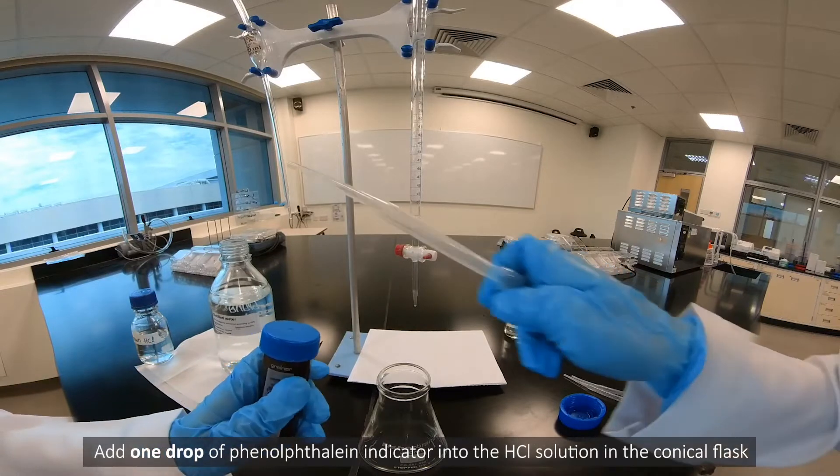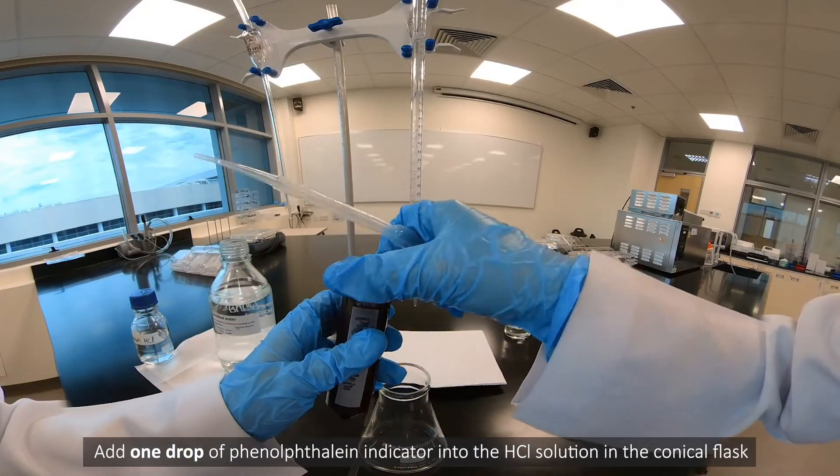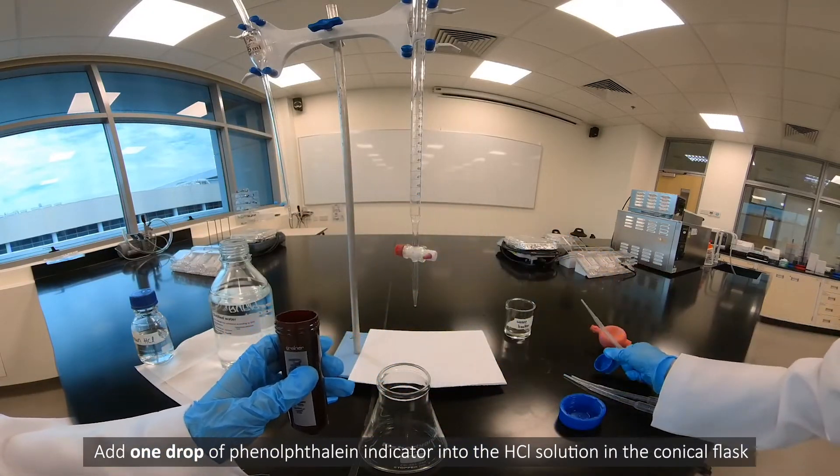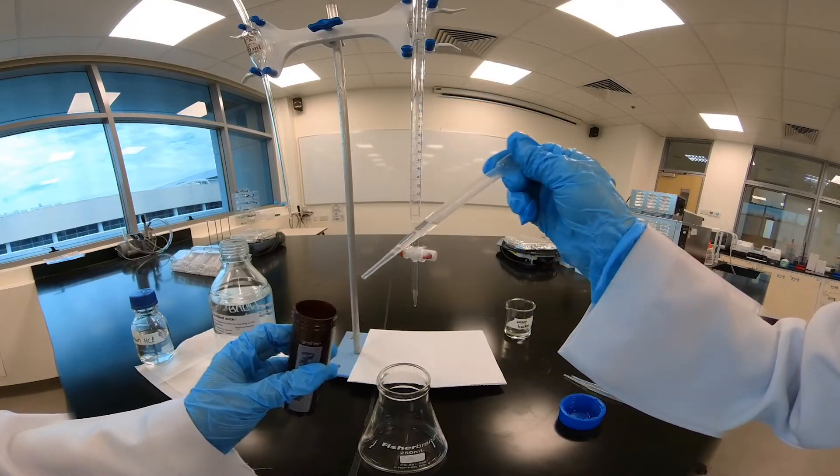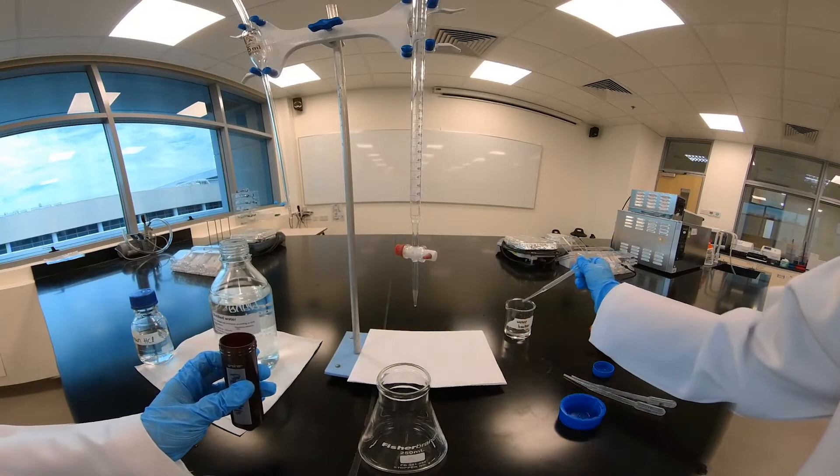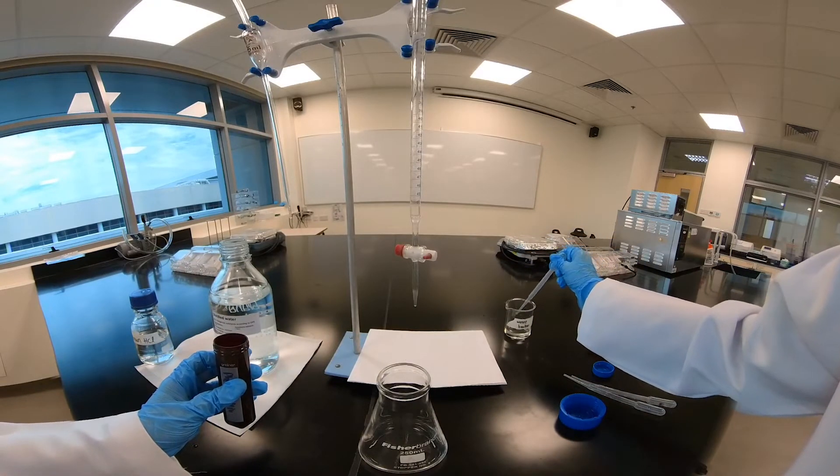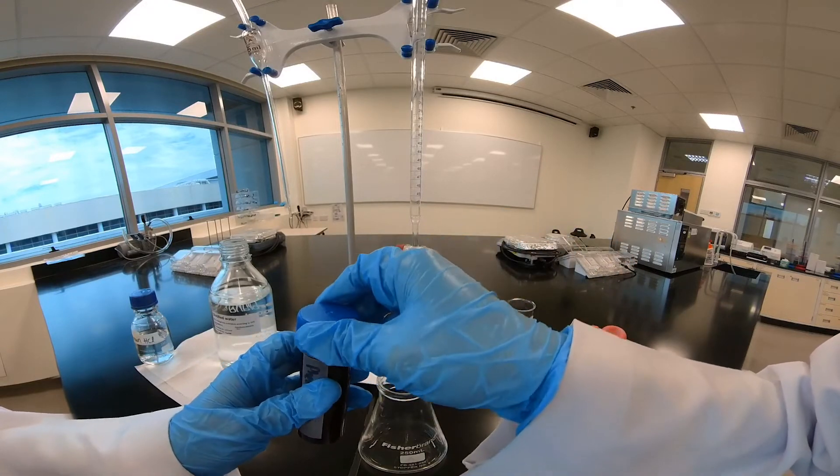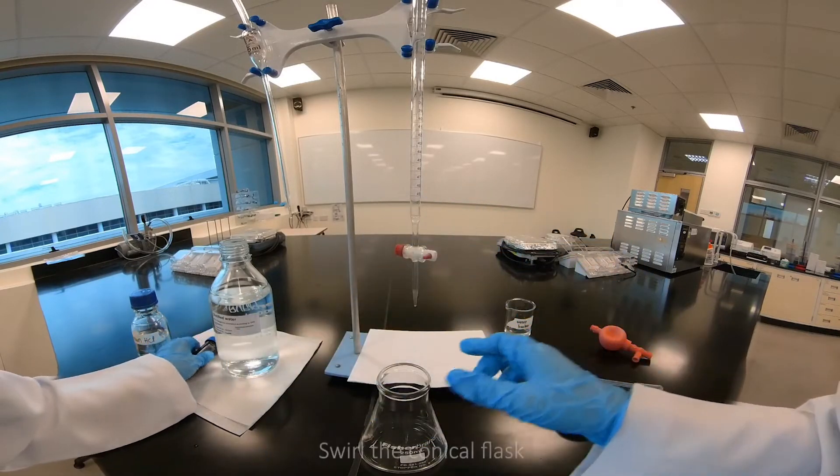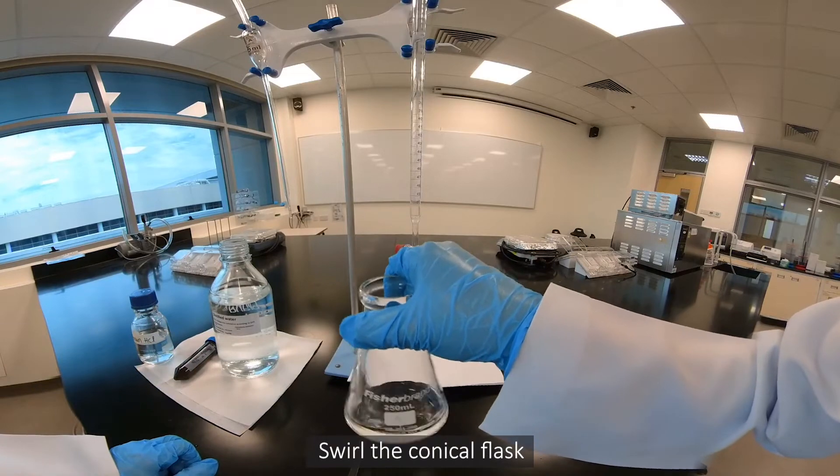Add one drop of phenolphthalein indicator into the HCL solution in the conical flask. Swirl the conical flask.